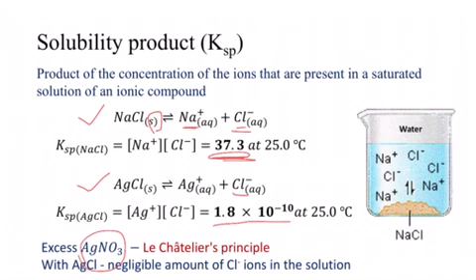Based on the Le Chatelier principle, chemical equilibrium goes to the left, and so we can assume all the chloride ions are in the form of silver chloride and only negligible amount of free chloride ions remain in the solution. Therefore, when you weigh the precipitate in a gravimetric analysis, you can be sure almost all the analyte, here chloride ions, are in the form of precipitate.